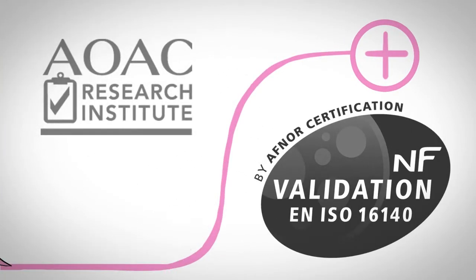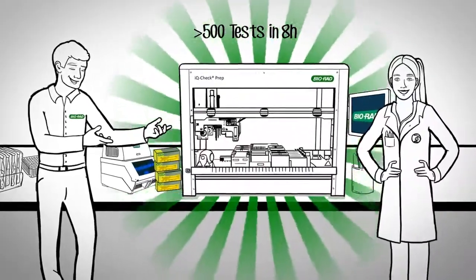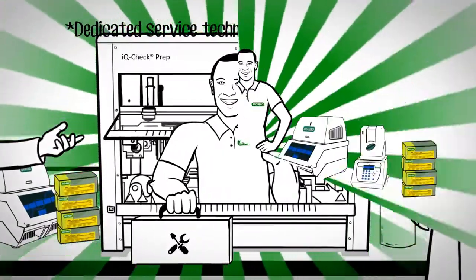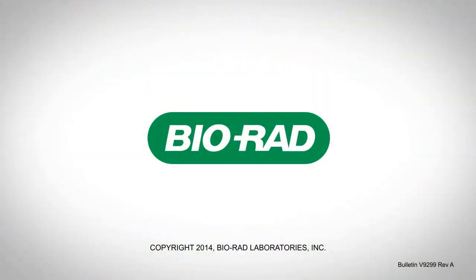AOAC and AFNOR validation ensure peace of mind when testing hundreds of samples. The IQ Check Prep system automates sample prep and is the perfect solution for higher throughput labs. Regardless of your testing volume, Bio-Rad has a simple and efficient pathogen detection solution for you.